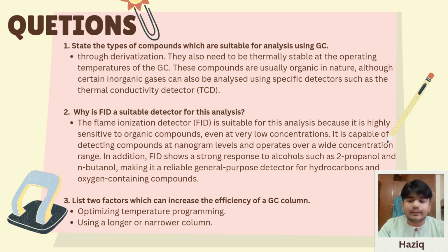The second question is why FID is a suitable detector for this analysis. The flame ionization detector, which is FID, is suitable for this analysis because it is highly sensitive to organic compounds. Even at very low concentrations, it is capable of detecting compounds at nanogram levels, and it operates over a wide concentration range.